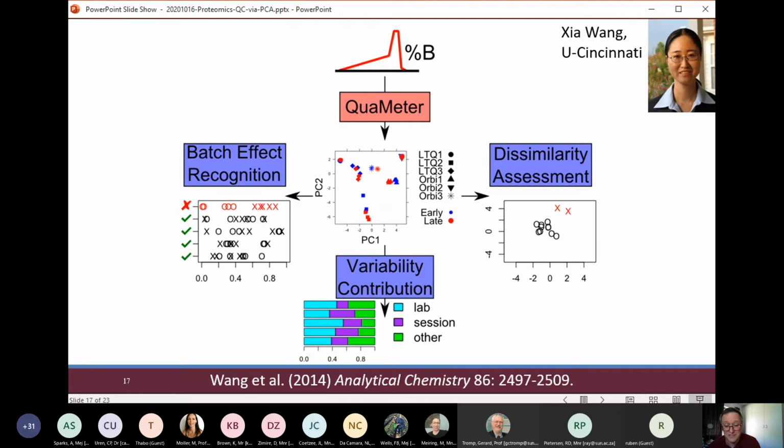It is essentially always a bad idea to run one cohort now and another cohort when the time arrives. If it is possible to put these together, or to run half of this batch and half of the other batch at this time point and so on at the later point, then maybe you could be okay. But generally speaking, if the time difference for the instrument is confounded with cohort differences, it's going to be very hard to come up with anything biologically meaningful from your data.